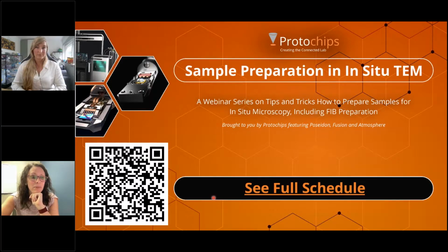Can the electron beam also heat up the sample and/or the electrolyte during a liquid cell experiment? If yes, how can you estimate the electron beam effect on cell temperature? This is a very good question and something that has been debated a lot in the literature, so it's hard for me to give one straight answer. There are papers that have said the liquid only heats up 1 to 2 degrees locally, which is not very much, and it diffuses really quickly.